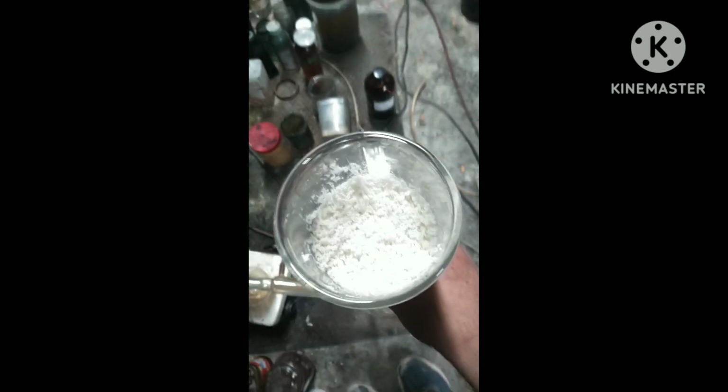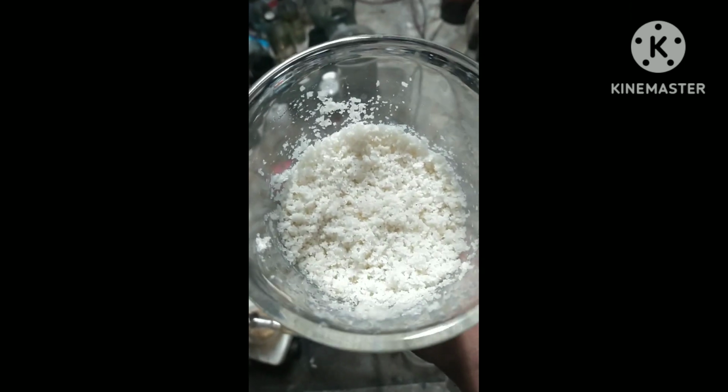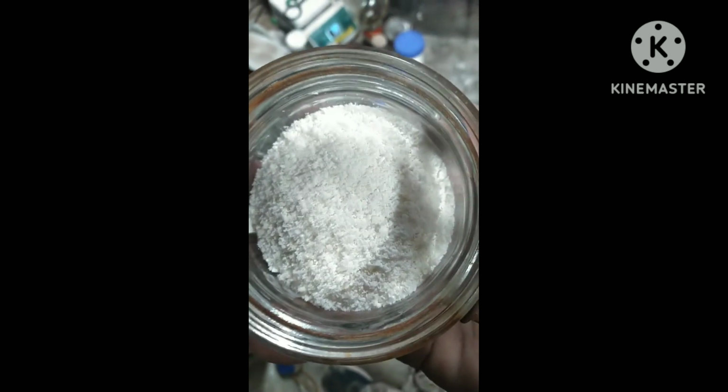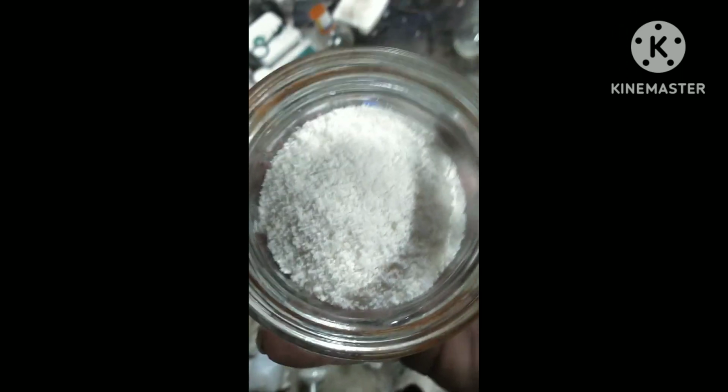Here's what it looks like before any acetone has been on it. It's just been vacuum dried. And there it is after being acetone washed, and all dried. Very nice and white. And that's how you do it.